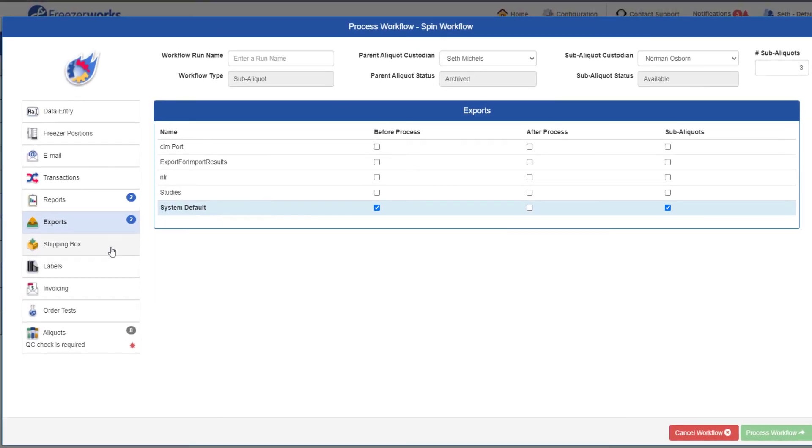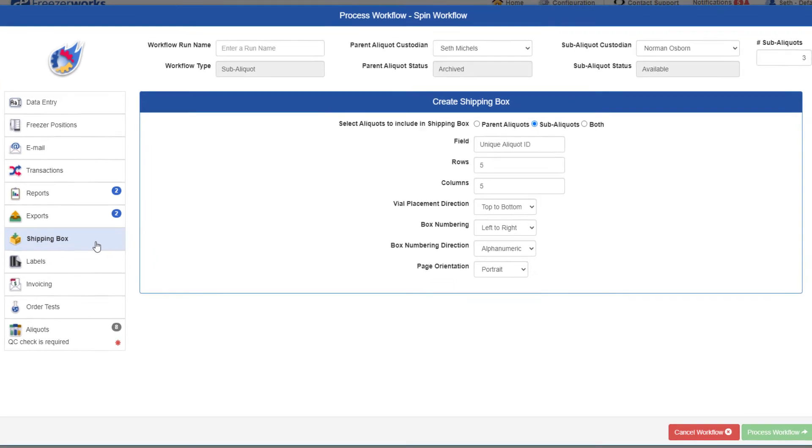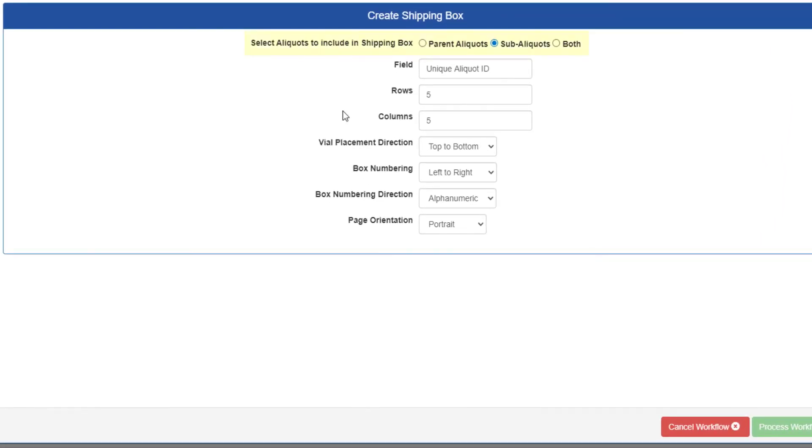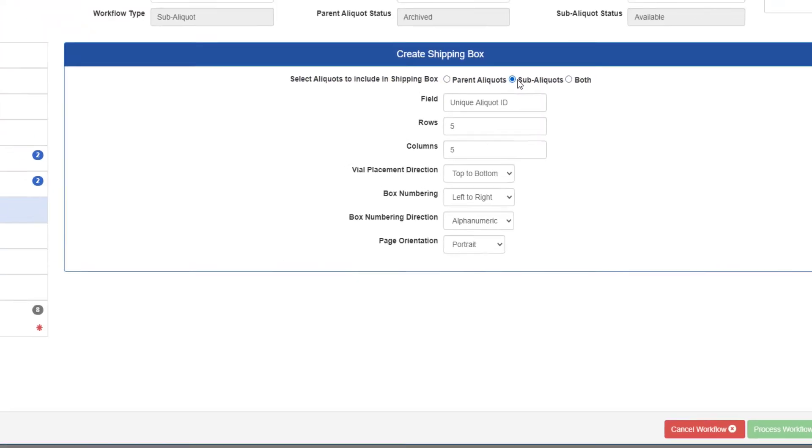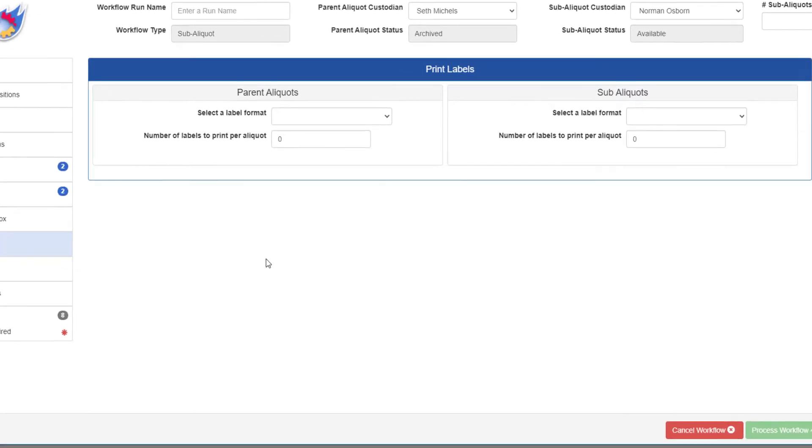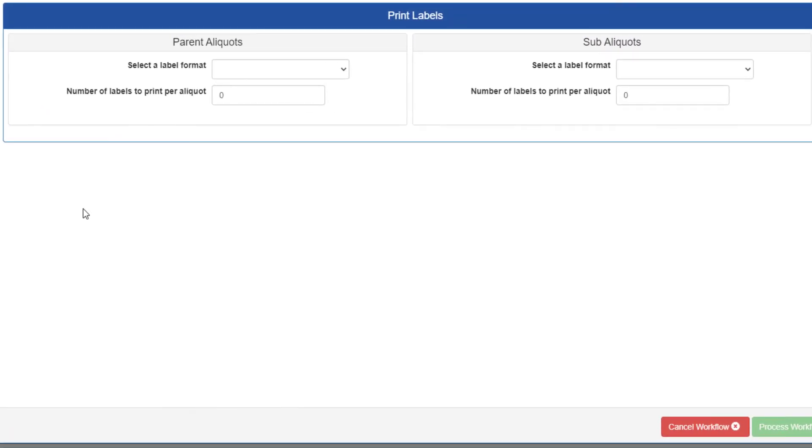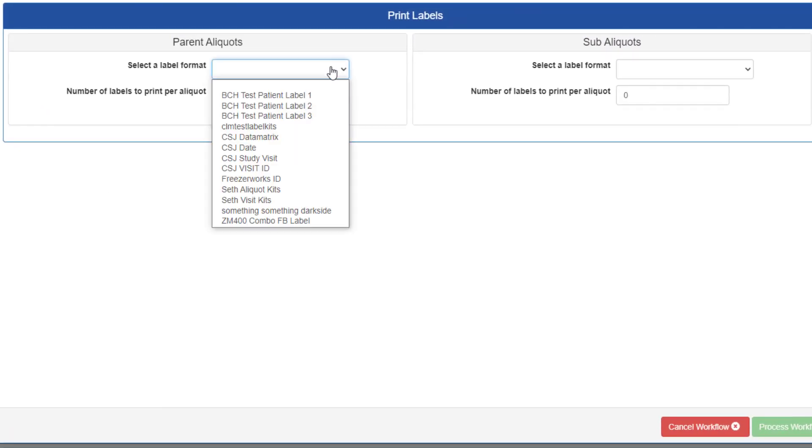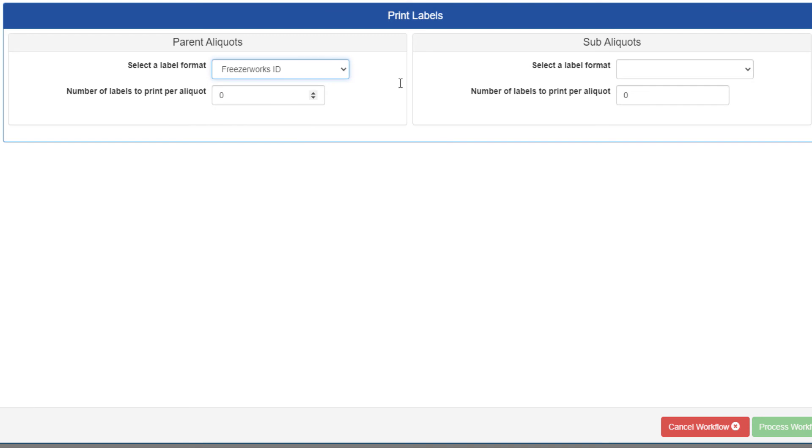With the shipping box page, you can decide whether the shipping box includes the parent aliquots, the sub-aliquots, or both. We'll go through the rest of this page in just a moment. On the labels page, there are two entry areas, one for parents and one for subs, so different labels can be printed for each group.